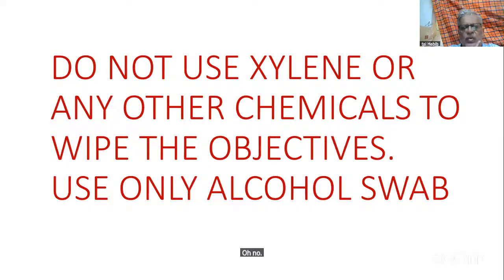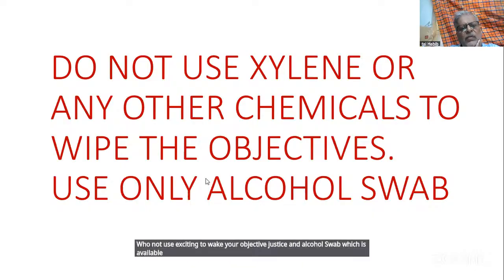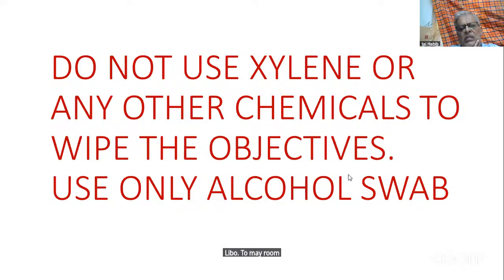Do not use xylene to wipe your objectives. Just use an alcohol swab, which is available in your phlebotomy room.